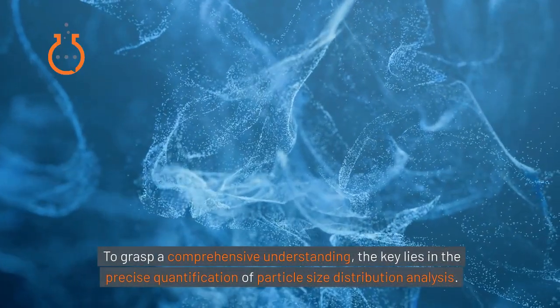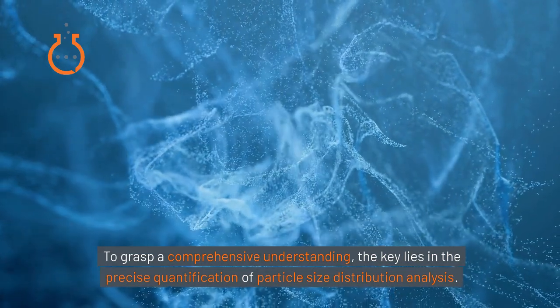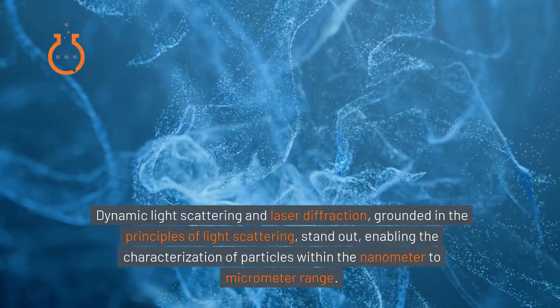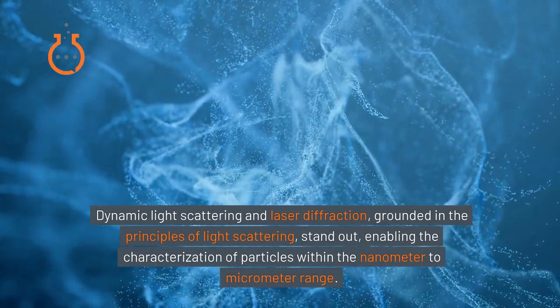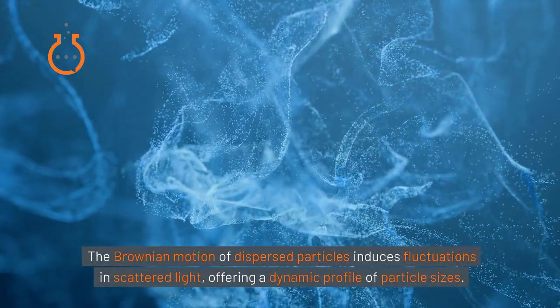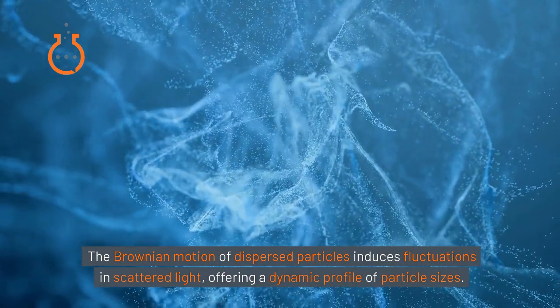To grasp a comprehensive understanding, the key lies in the precise quantification of particle size distribution analysis. Dynamic light scattering and laser diffraction, grounded in the principles of light scattering, stand out, enabling the characterization of particles within the nanometer to micrometer range. The Brownian motion of dispersed particles induces fluctuations in scattered light, offering a dynamic profile of particle sizes.